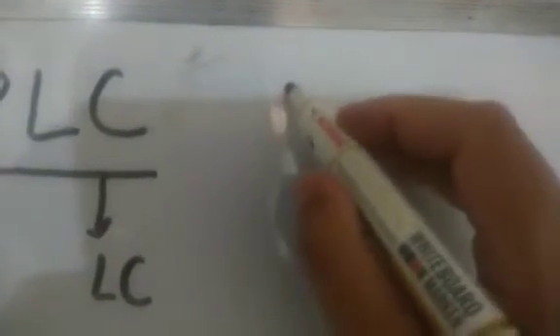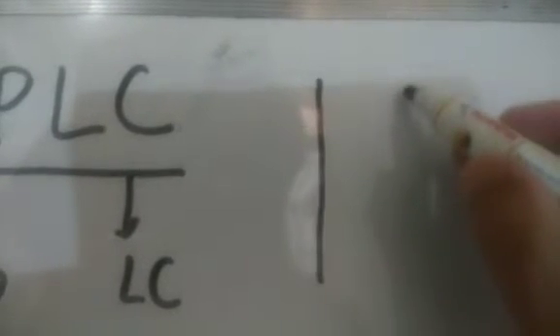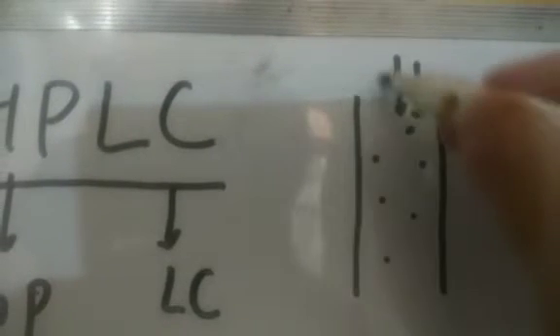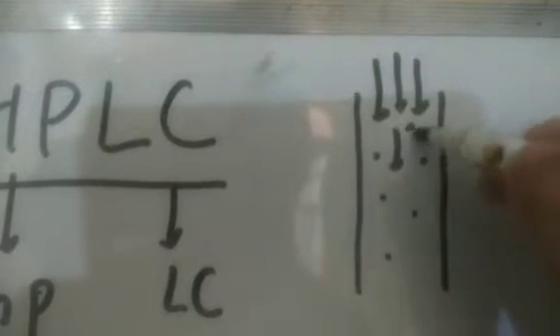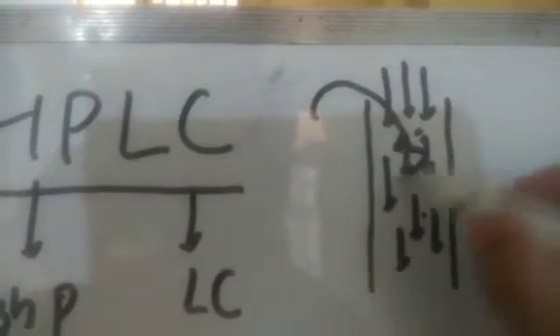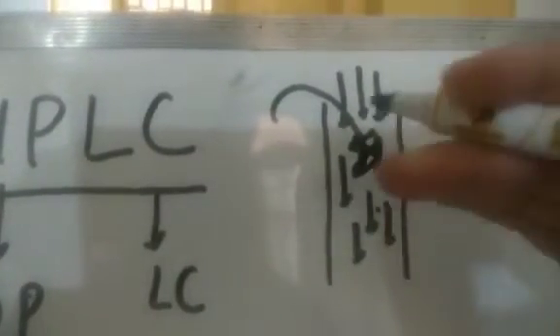So अब इसमें क्या होता है, जैसे नॉर्मल क्रोमेटोग्राफी मैंने बोला था कि just this is your column, then this is packed with the stationary phase, then you allow your mobile phase to flow through, drip through under the gravity without any external pressure, and then when you have the samples inserted inside, they will get separated based upon their interaction with the stationary and mobile phase.